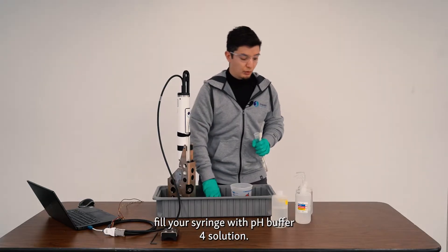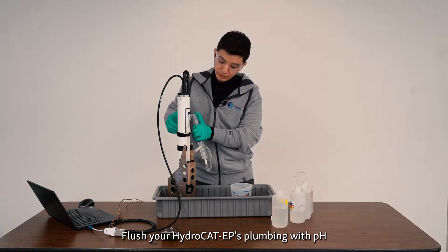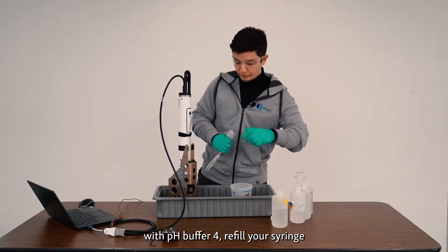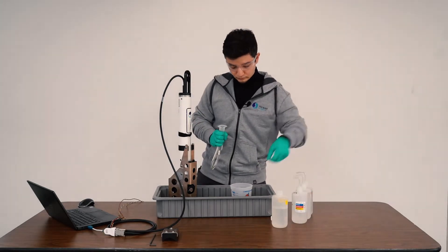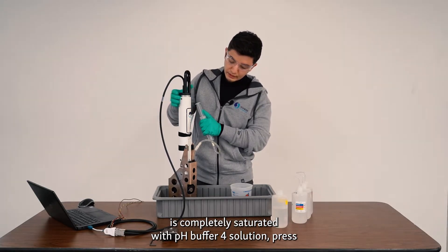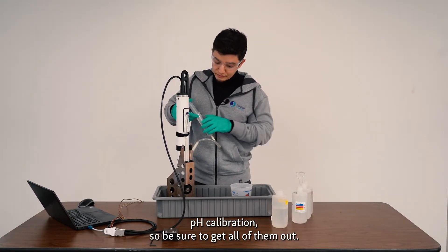Next, fill your syringe with pH buffer 4 solution. Flush the plumbing with the pH buffer 4 solution and empty it into a basin. Once you have flushed the plumbing with buffer 4, refill your syringe with pH buffer 4 solution. Make sure that your plumbing is completely saturated with pH 4 buffer solution. Press the plunger down and shake your HydroCAD in order to get all the bubbles out of the plumbing. These bubbles will influence your pH calibration, so be sure to get all of them out.